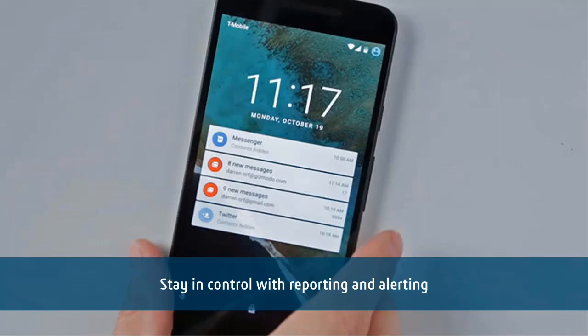And in terms of knowing if something went wrong and where, because you didn't go through every step of the analysis visually in the application, the report at the end that can be sent to you via email can contain this information.